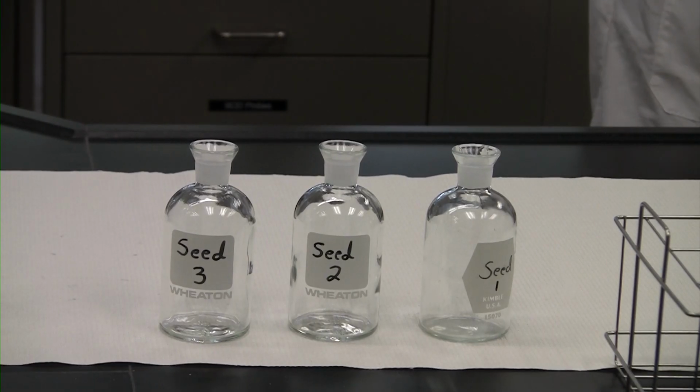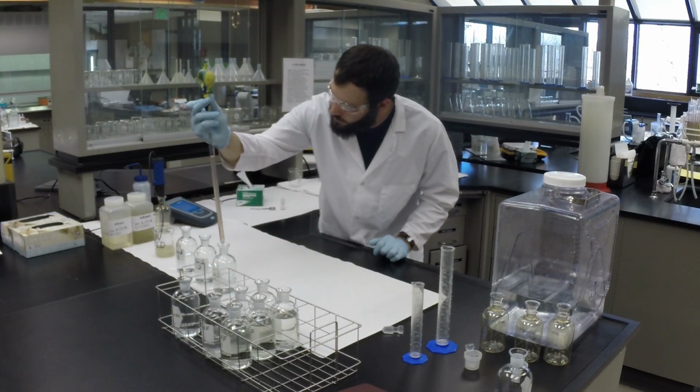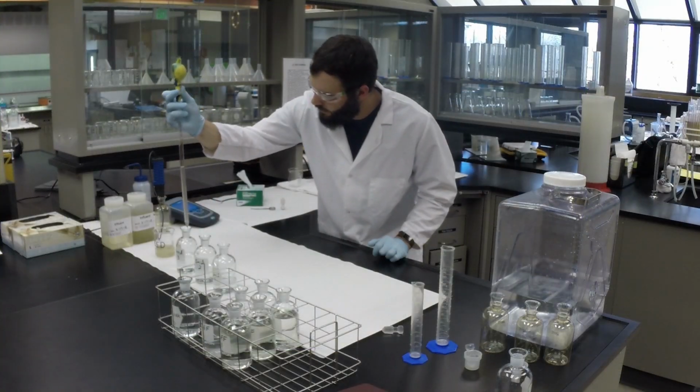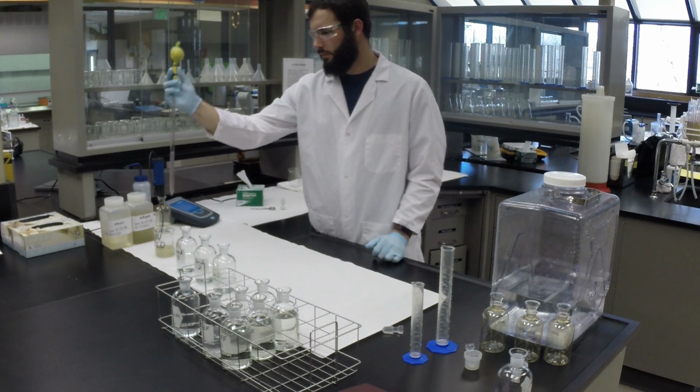Seed bottles. As discussed earlier, once you have determined your seed source, you will need to make 3 seed control bottles. We are using processed water from a wastewater treatment plant and adding 3, 6, and 9 milliliters of seed to our different seed control bottles.